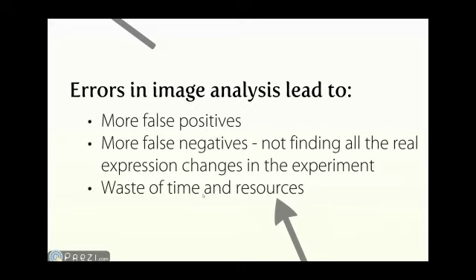For example, amalgamation is a great example of this. It usually hides a lot of potentially interesting changes. And thirdly, it's also, of course, a huge waste of time and resources to wade through these false positives and negatives.